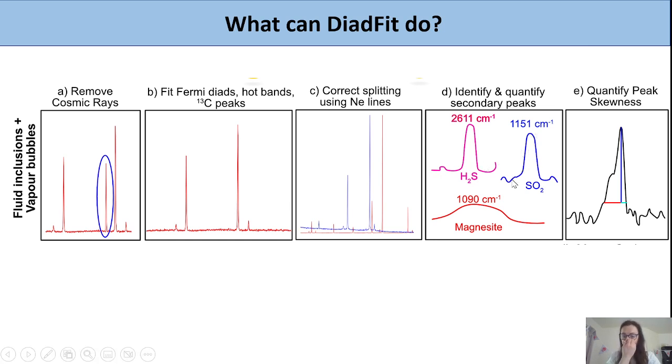Another thing it can do: many acquisitions in fluid inclusions and vapor bubbles contain secondary peaks, which can tell you about phases on the wall of the inclusion. DiadFit can identify these peaks and quantify their heights and areas. This means you can start looking at things like the ratio of the SO2 peak area to the CO2 peak areas to approximately quantify molar proportions.